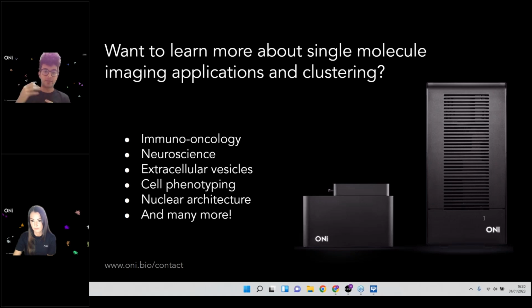You could perform, for example, a DBSCAN clustering with a very high epsilon value to pick out large clusters, let's say a nucleus. And then once you've picked out those clusters, you could apply another clustering with a region of interest defined by the first cluster, so that you're clustering only inside that nucleus, and you could do this for every nucleus.